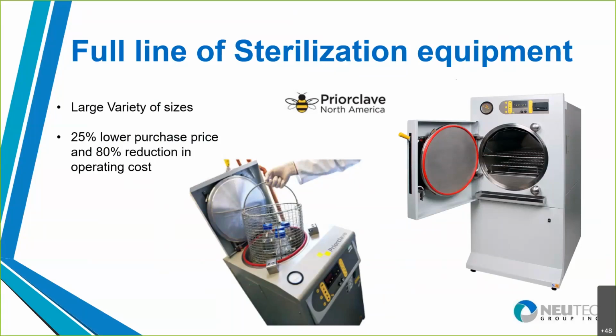Not only that, but it reduces operating costs because it doesn't require as much energy input, nor does it require as much water use. So it's really environmentally friendly. It improves the greenness of your processing because there's not such a need to utilize so much water in the process itself. So some good solutions there for situations where you do need an autoclave.